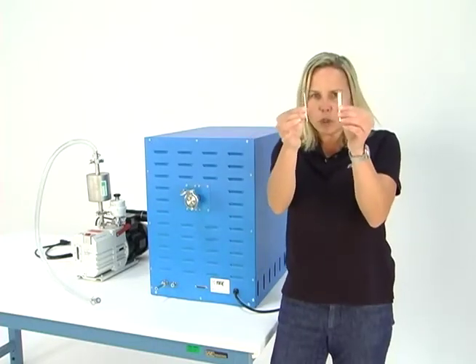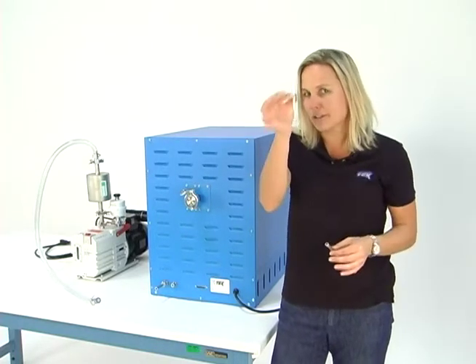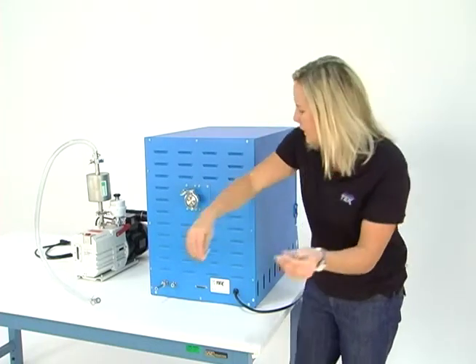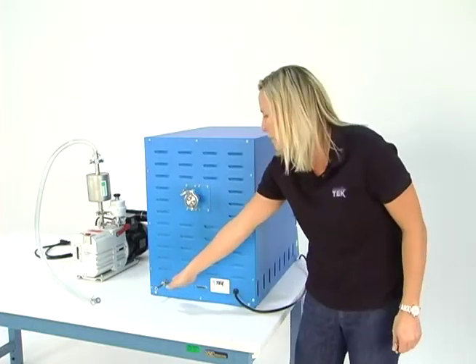Locate these two barbs. There's a big one — it's about three-eighths inch diameter — and there's a little one, about a quarter inch diameter. These two barbs are going to need to fit into the back of the oven here down at the bottom.